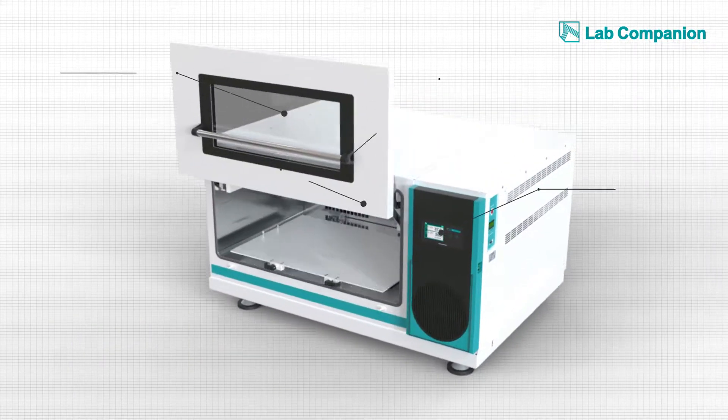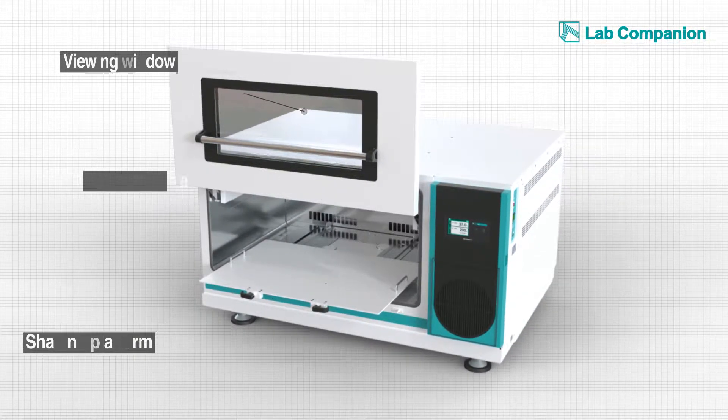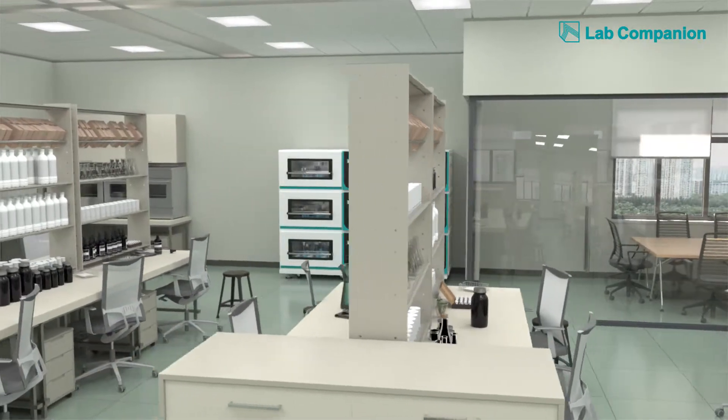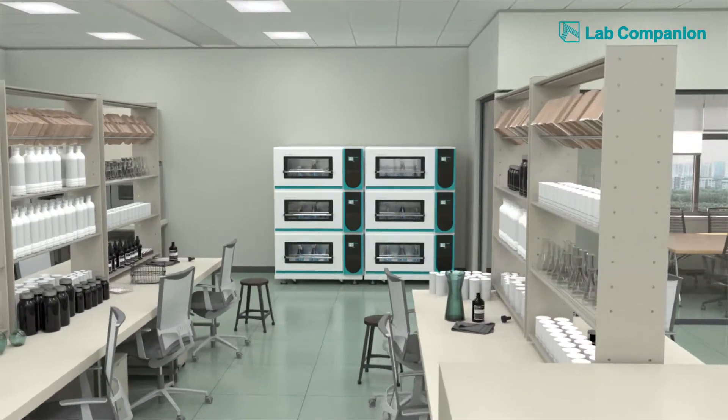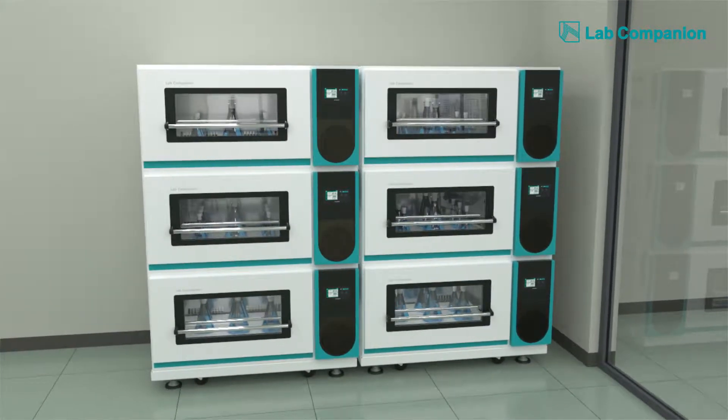Its main components include a large incubator, inspection window, door, shaking platform, and control panel, all of which are designed for the most stable structure so that a multitude of experiments with intensive shaking can be simultaneously conducted in a tight space.